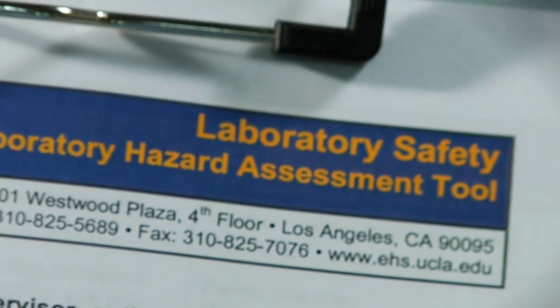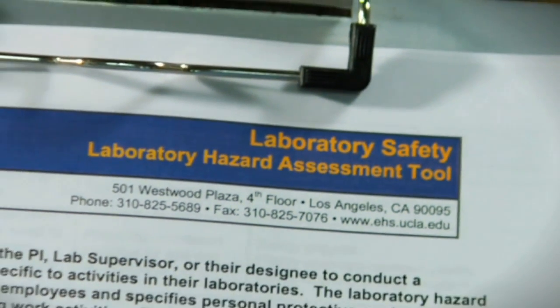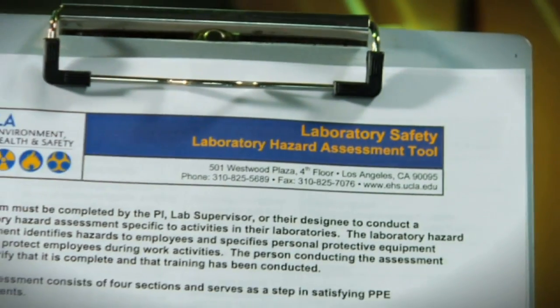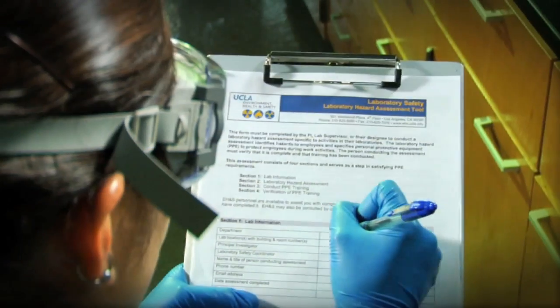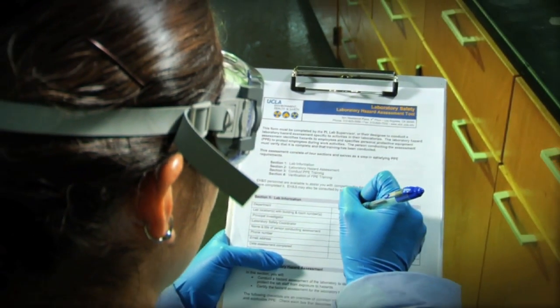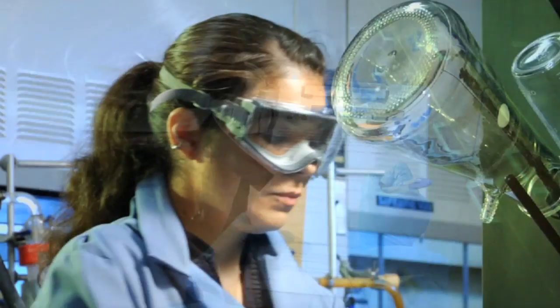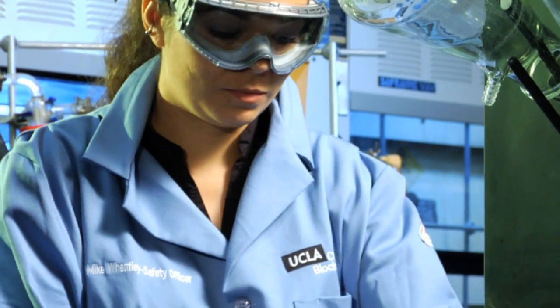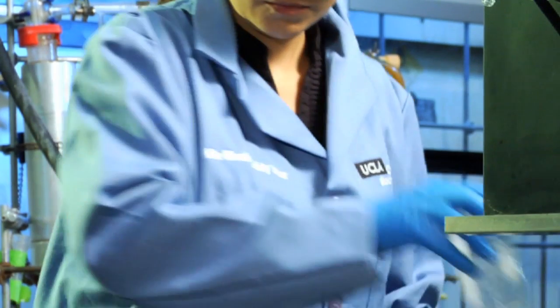Begin by reviewing potential laboratory hazards using the UCLA Laboratory Inspection Checklist and the Laboratory Hazard Assessment Tool. Copies of these documents must be kept in your laboratory manual. Once hazards are identified, proper steps can be taken to mitigate their danger.